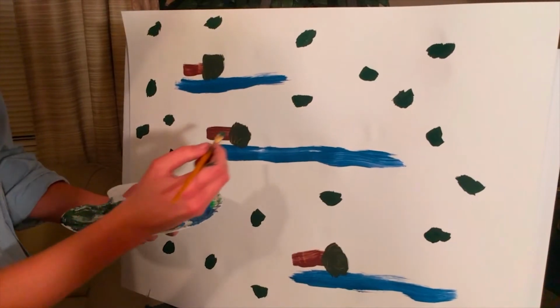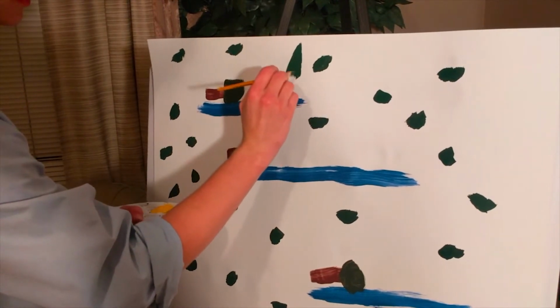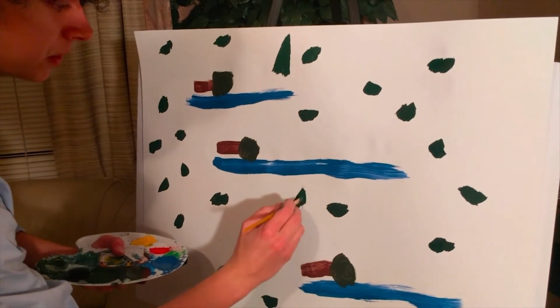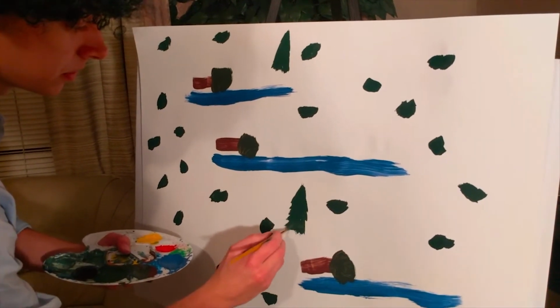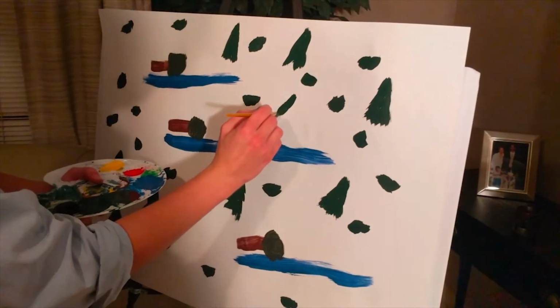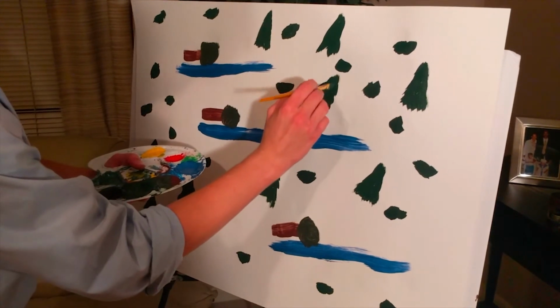But we also got to add in some dideoxynucleotides. And see, they're special because DNA polymerase can't add on to them because they don't have a 3' OH group at the end. And so to symbolize them, make them a little different, we'll just show them as a big old tree, like so. Alright. Now dideoxynucleotides, we're going to only add 1 of each of them in our test tube right here, and then each of the 4 test tubes will have a different one. So let's just pretend we have adenine in here.